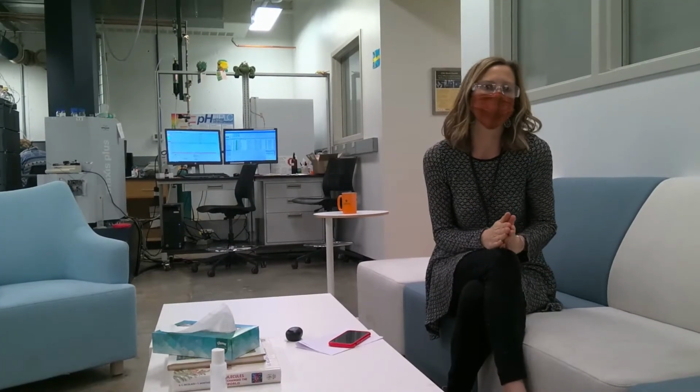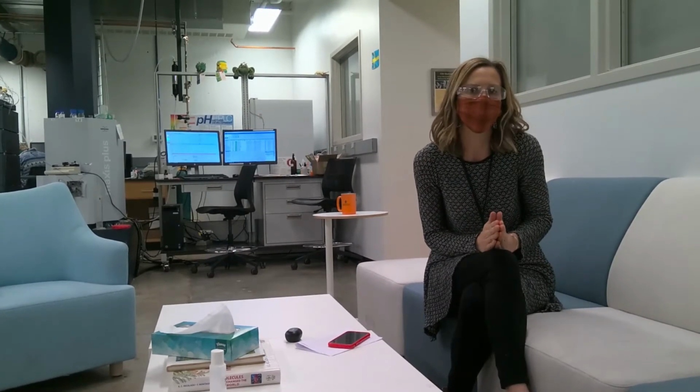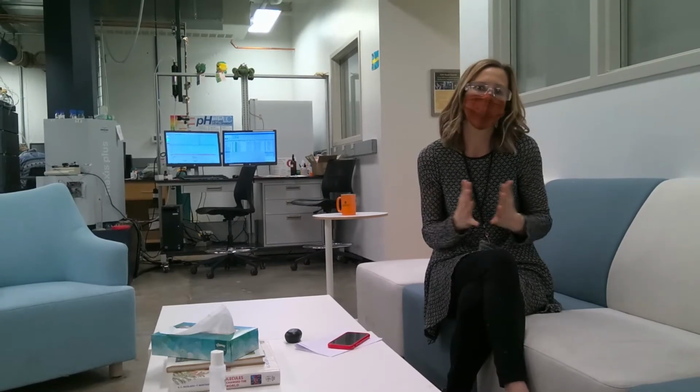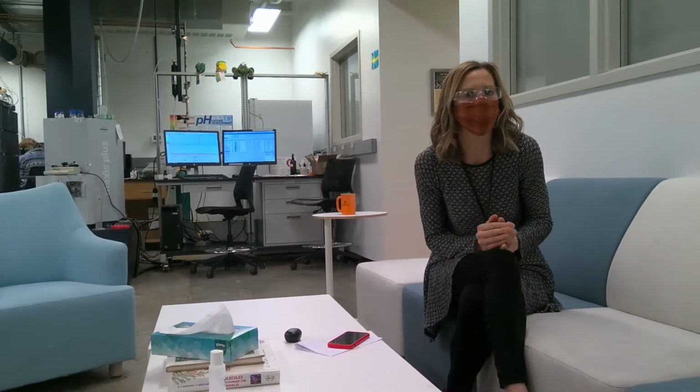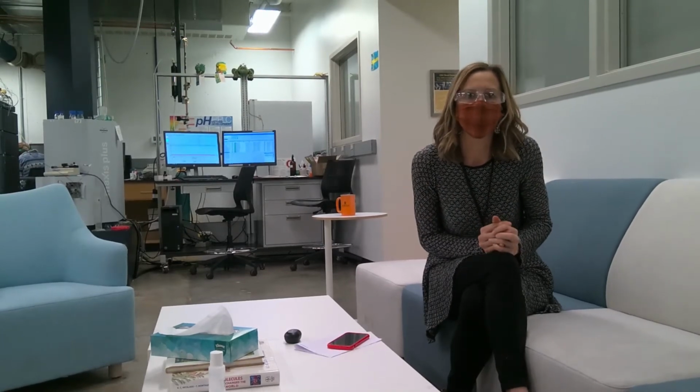I did not have a chance to show you the laboratories of the ARC Bio Center, the Bioanalysis and Omics Center. But if you need advanced metabolomics or proteomics mass spectrometry, the ARC Bio will definitely help you and provide you more information.